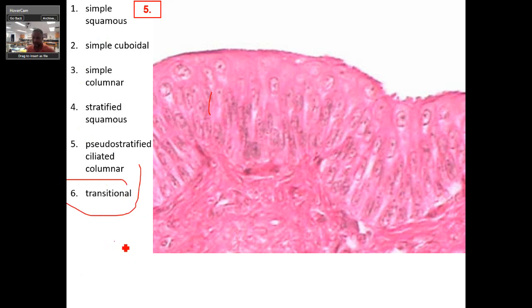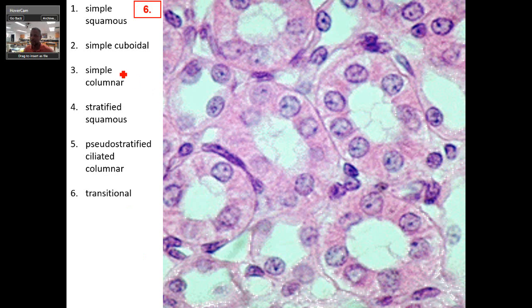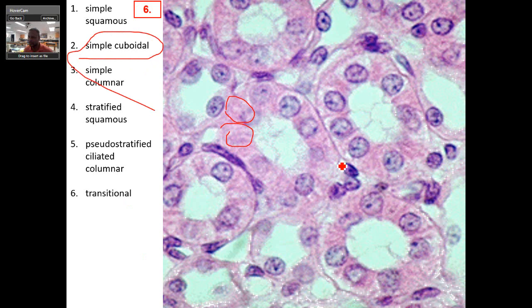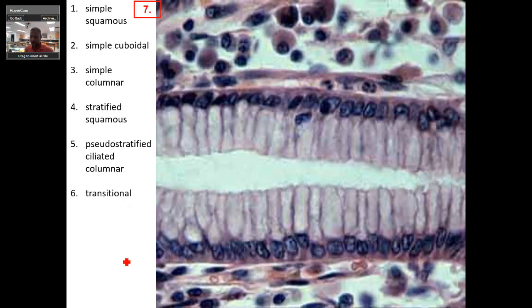By the way, this PowerPoint is on a timer — that's why I call it the speed round. Simple cuboidal — there's a cell, there's a cell. Next one — this would be simple columnar. All the nuclei are kind of uniform, unlike pseudostratified.